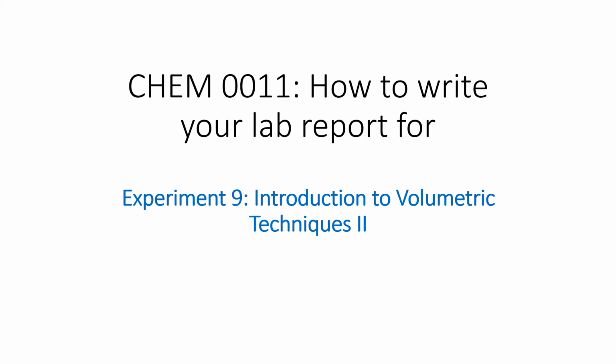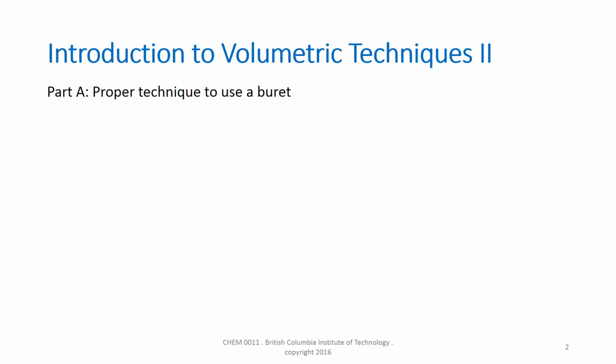Welcome to the video on how to write your lab report for Experiment 9, Introduction to Volumetric Techniques 2. In Part A of this experiment, the proper techniques to use a burette will be learned.